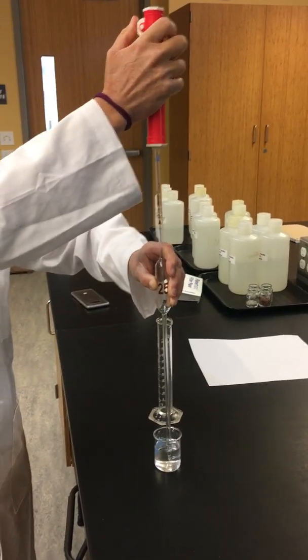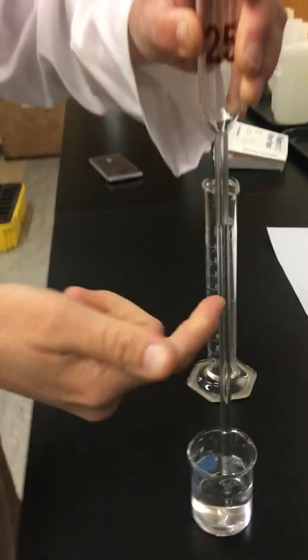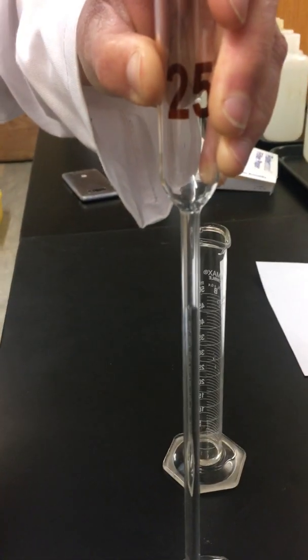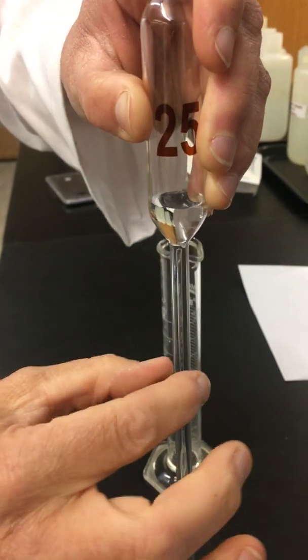Now how these pipette aids work is we turn the dial, and as we can see, we have volume coming up into it. When doing this, we have to be careful because it goes through this thinner part of the pipette much faster than it does this thicker part.